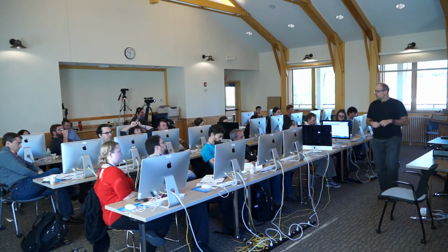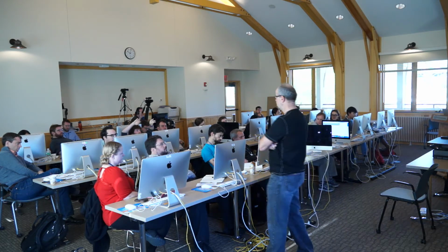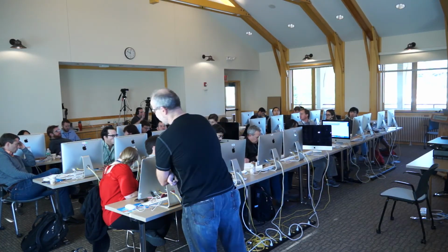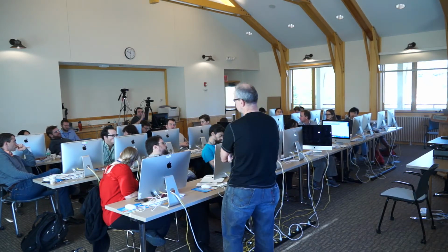Yeah. So with Rufus, are you still throwing out duplicate reads before? Because I guess you're just taking pieces of the reads and comparing them to each other? Yeah. So you still throw out the duplicates first, so you don't have a preference. Andrew, why don't you? There's no mapping or anything, so you don't know what the same is.